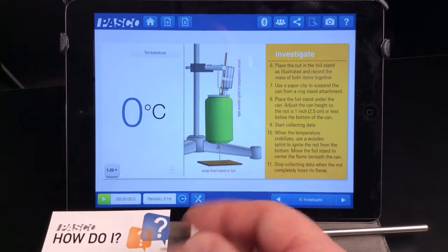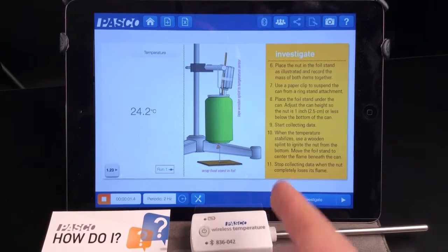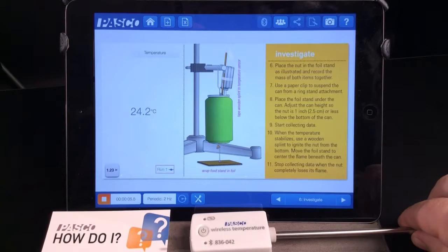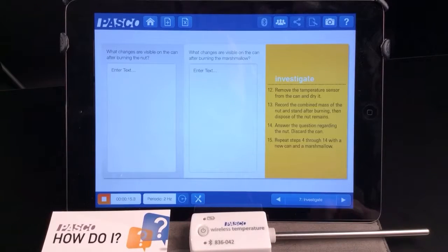In this example, students are asked to record temperature data from a temperature sensor while looking at this page of instructions, an illustration, and a live display of the reading from the temperature sensor. However, this data collection occurs over many minutes, and they may be interested in seeing a graph of their data as it's collected. Well, there are graphs later in this lab, but not on the next page.